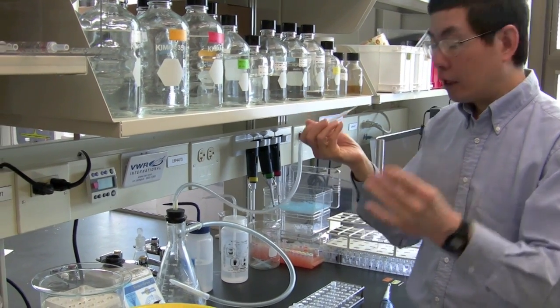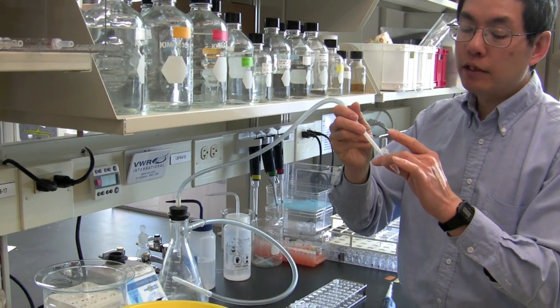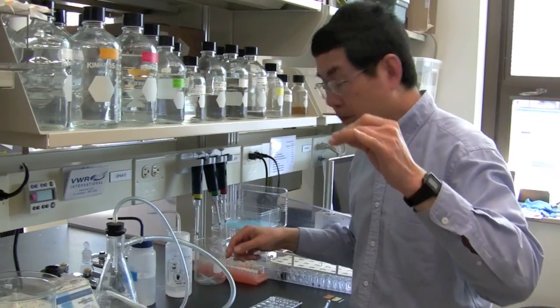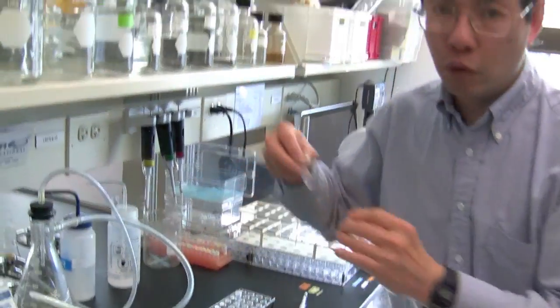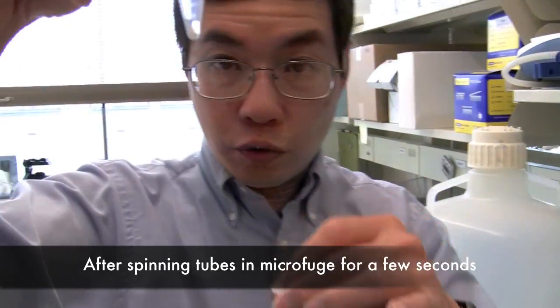You don't have to get all of it off in the first one because we're going to spin it a second time. The problem is there is a significant amount of supernatant still sticking to the sides. If you look at how much, this is for number 2, you can see how much supernatant I've got left behind. And after spinning a second time, you'll see that significantly more will come down. That's just a few seconds spin. And this is number 2. You can see that there's more supernatant that has been brought down compared to before.